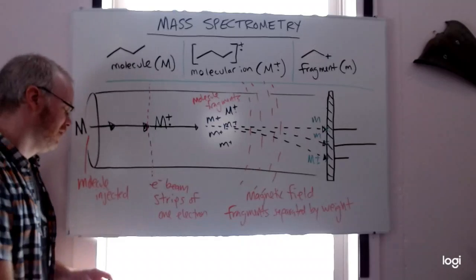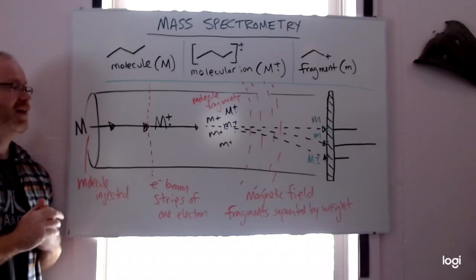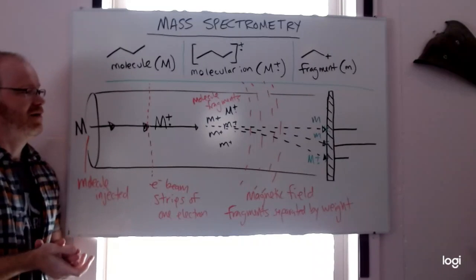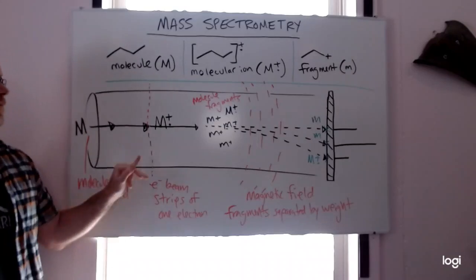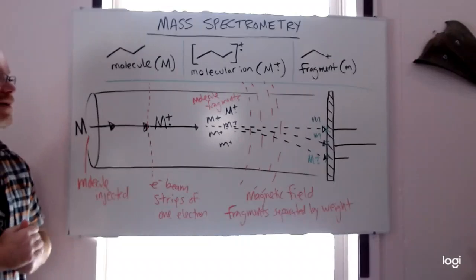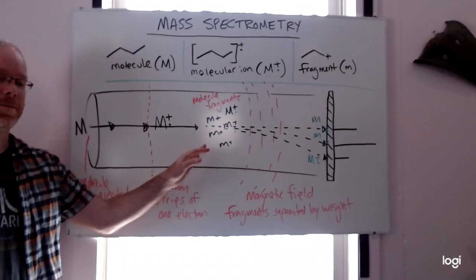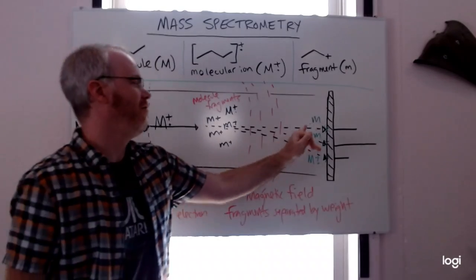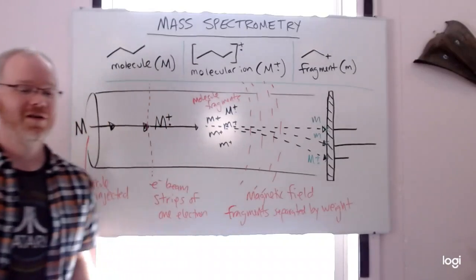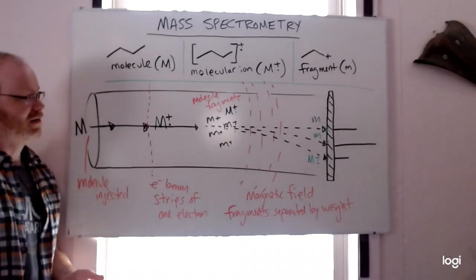So that's part of the really useful piece of mass spectrometry: you can use it for detecting molecules, and you'll get a readout and be able to look at masses of all those fragments. But each particular molecule will fragment differently, and all the different fragments you get and the relative abundances of those signals can help us detect what the eventual molecule is going to be.